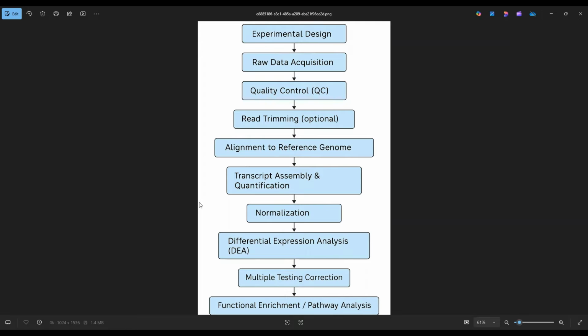I will explain one by one where these raw files are stored. But first, go through the whole process, and then we can do the next tutorial about where these files are located and how you can download them.